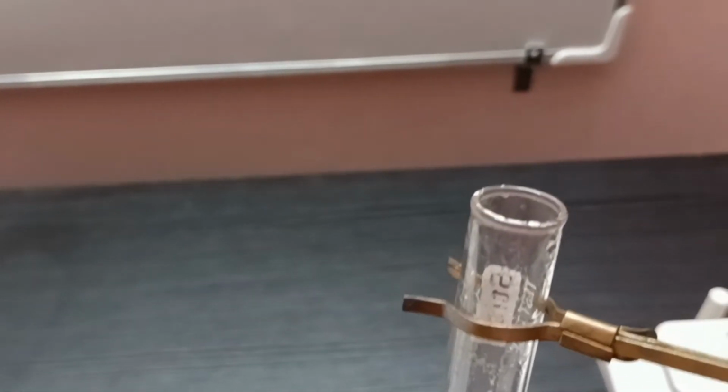This is sulfur dioxide and sulfur trioxide gases. Let's see the nature of the gases. Are they acidic or basic?